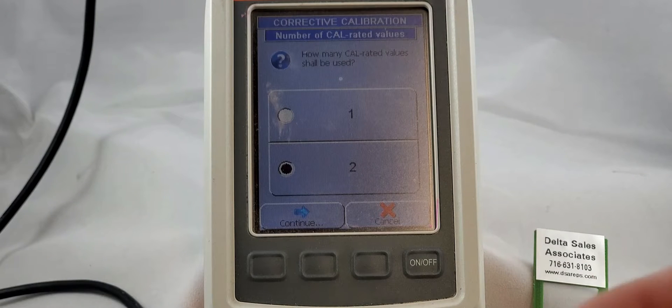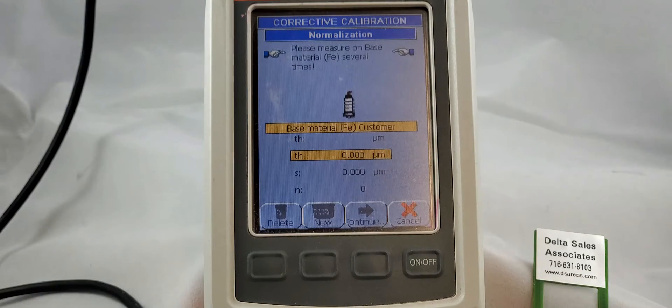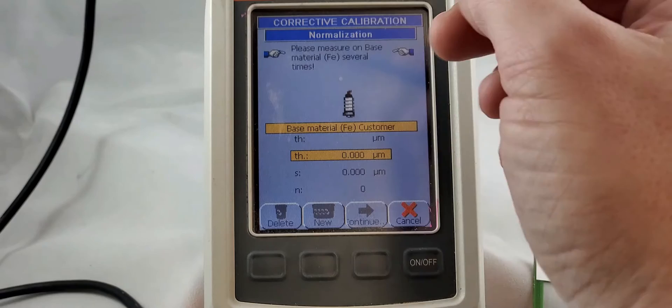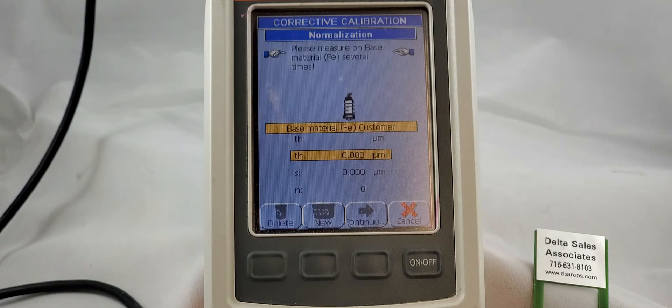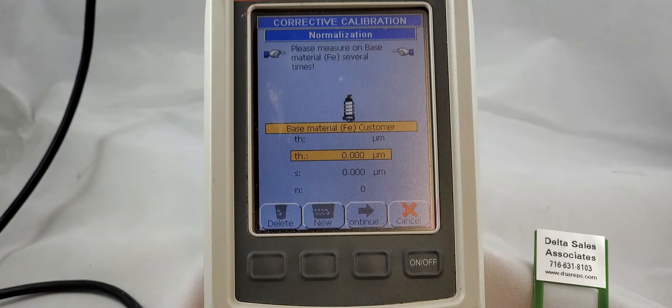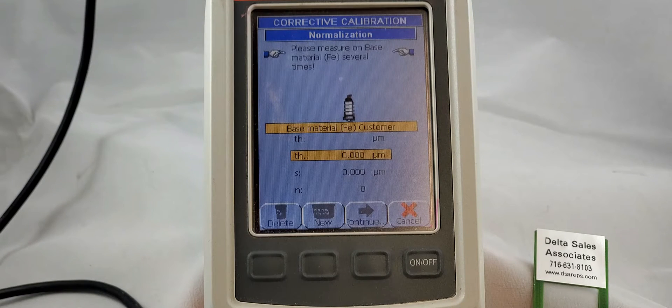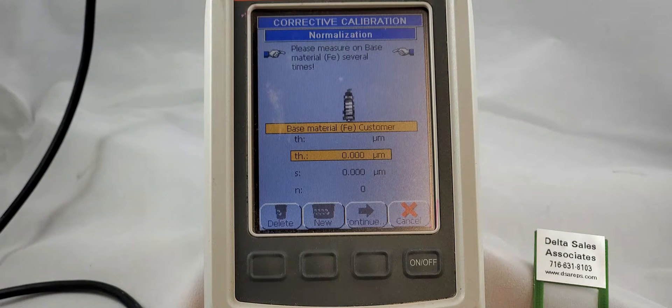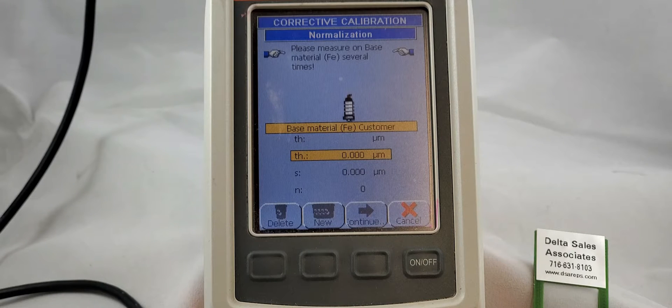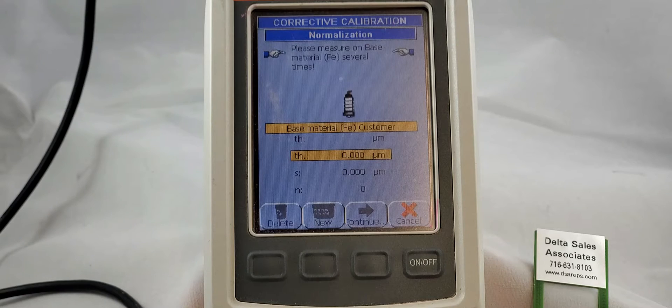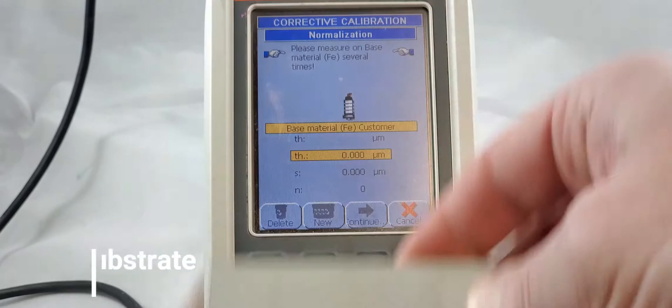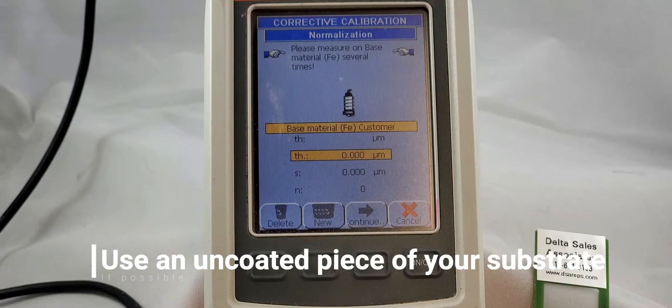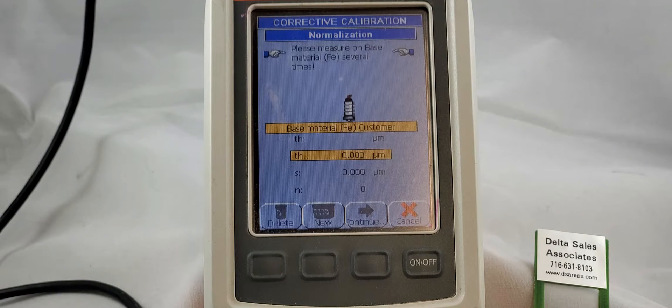So we're using two, so we're going to say continue and it's going to ask you to measure on base material and it's going to remind us what material we're using. In this case we are set up for ferrous or steel substrates. If we had an eddy current probe on there for non-ferrous substrates it would say NF. If we had a dual probe it would give us the choice of which one we wanted to do and we would actually make that choice by measuring on the substrate that we want to use. We are on steel. I have got a nice piece of cold milled steel. If you have an uncoated piece of your substrate use that - you will get better results.